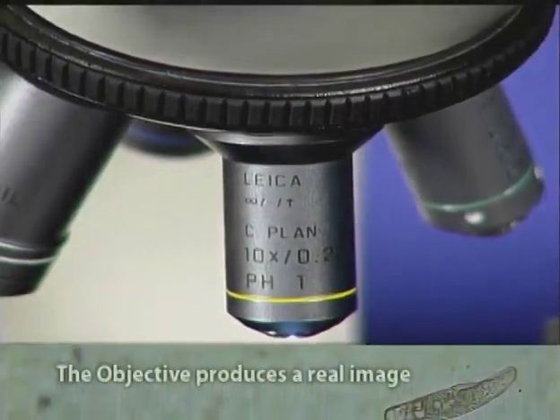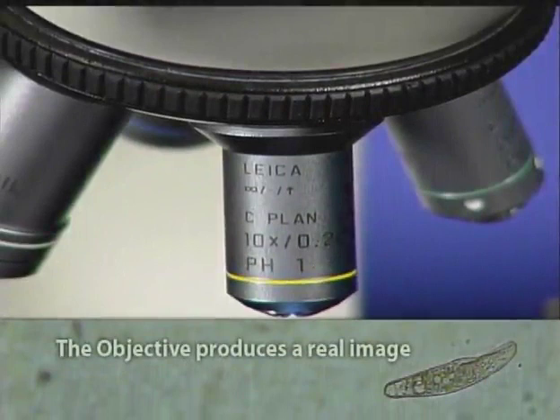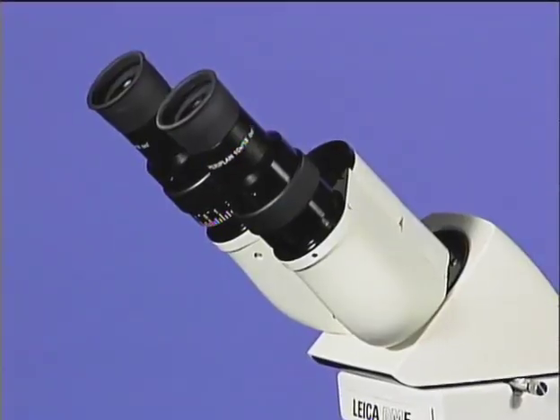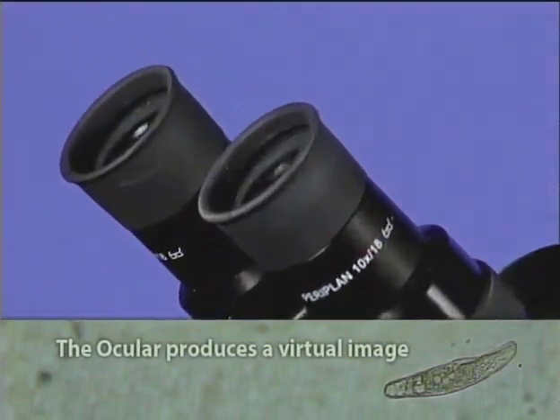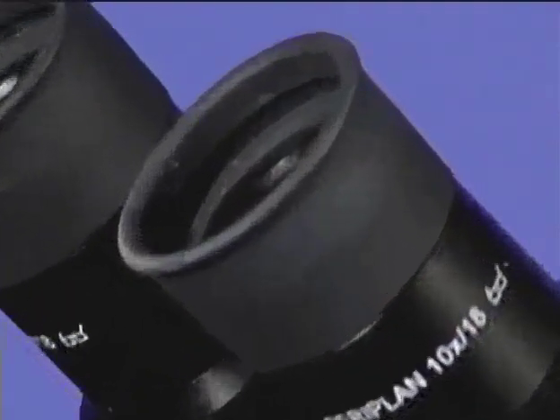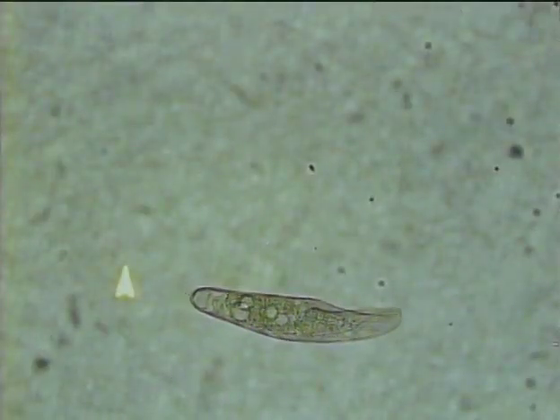The objective lens system produces what is called a real image. This image cannot be seen directly, but can be projected to the ocular lens system, which then produces what is called a virtual image. This virtual image is what you actually see when you look into the microscope.